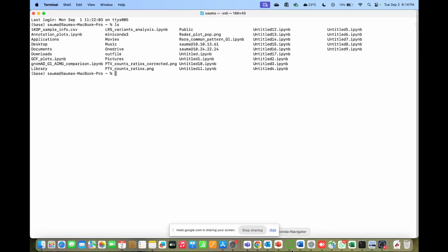Firstly, I would want to connect to a system which has the data. In general, this is how it happens: you have another system where all the data is stored, probably a Linux system. You connect your computer to that system and then do your work on it. The basic way to do it is to use SSH clients.